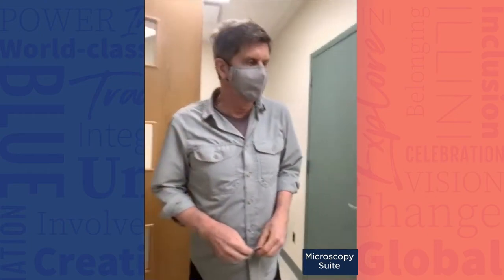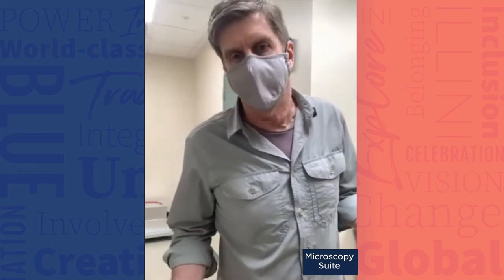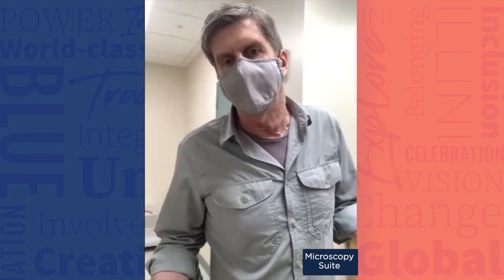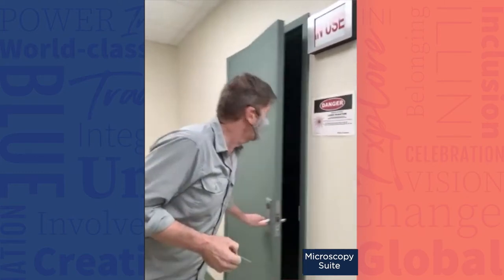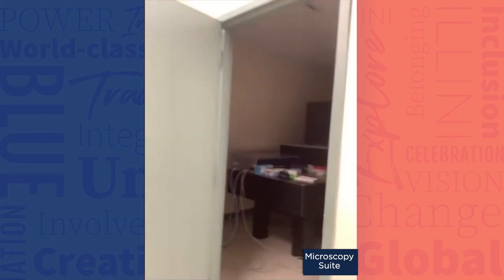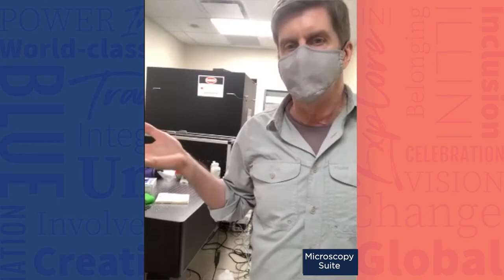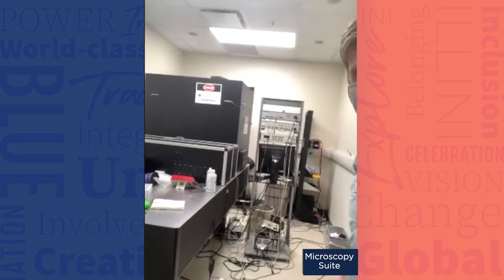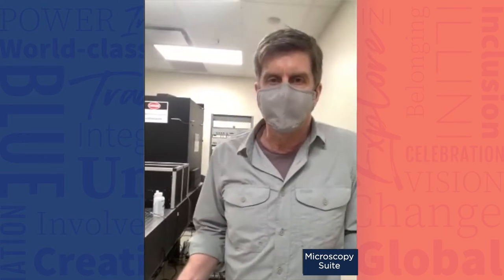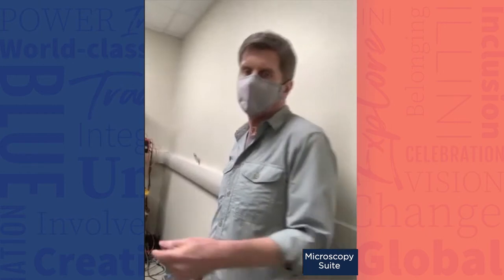The space we're in now was built for a researcher who wants to do two-photon/multi-photon imaging on live rats. What we did is we built a soundproof room in here. When you have two-photon/multi-photon on a microscope you have to be a lot more careful, so it has a great big enclosure around it and you're supposed to keep everything closed while you're imaging. This is a Bruker system, and it's also set up for electrophysiology.